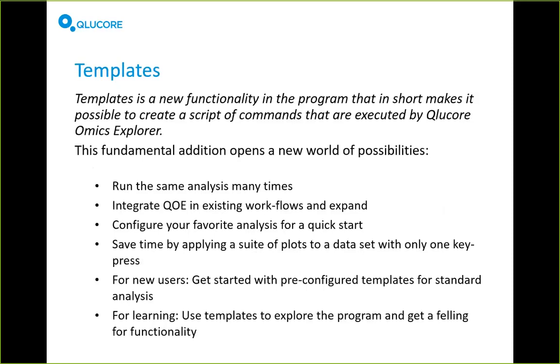Another thing you could do with this, of course, is to integrate Omics Explorer in existing workflows and expand them. And what do I mean with that? Well, let's say that you have some data in a format that we don't support at the moment. Although we support many forms of data, and we also support a kind of wizard import, where you can import your data by telling Omics Explorer about your data. You might have a data format that we don't support at the moment, but it could be convertible to something that we would understand.